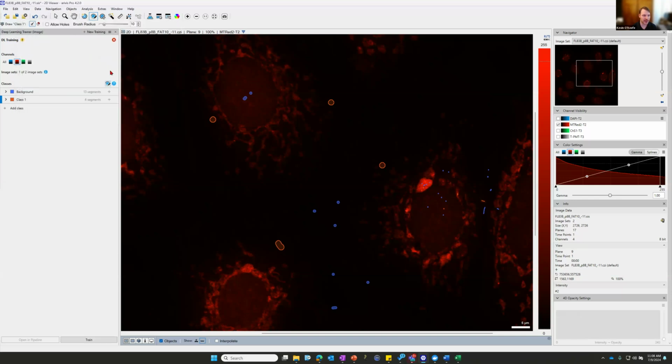And then when you hit train, there should be a window that pops up and it says that we need at least 5 training images. But then there will be a little GUI that pops up and it'll say, epoch 1 of 400. Here's the result of the training for this first epoch, second epoch, etc. And then it'll give you a status update on how much training it has left to do. If you stop the deep learning training early, if you stop it at like 200 out of 400, it will still have that first 200 epochs included in the training, and then you can run it at that point. So if you find that maybe it's doing really well and it starts to level out and it's only halfway done, maybe it's probably easier to just stop the training early because it doesn't seem like that extra hour of training is improving it. So why let it run for an extra hour then?